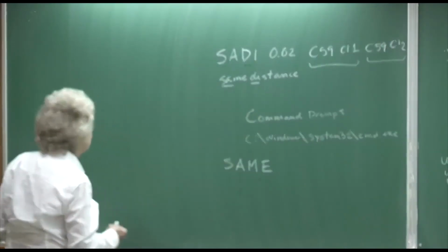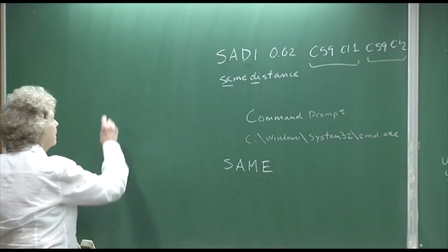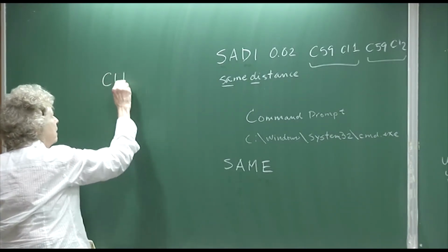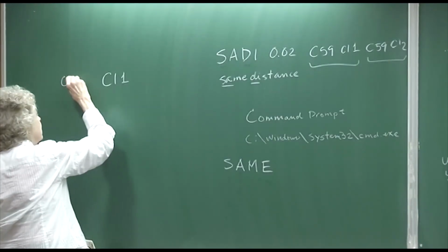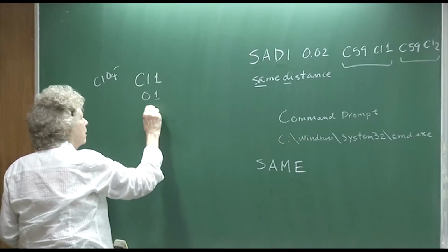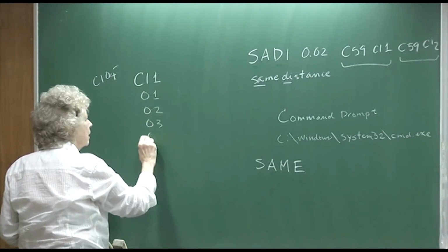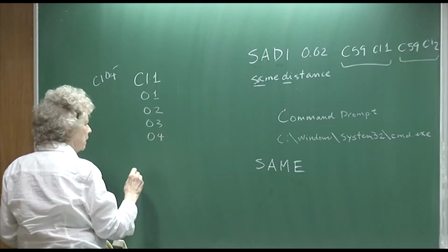And the order in which you put things is pretty important. Let's just take a simple example. So you have a really nicely defined perchlorate, and then a bad perchlorate following that.